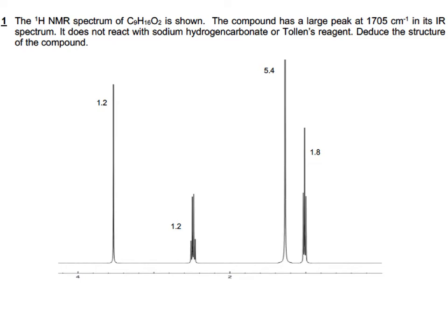We have these peaks, and they are called signals. In this particular spectra, highlighted with green, are 4 signals. I'm going to refer to them as hydrogen environments. They are unique hydrogen environments, which I'll explain a little bit more in a short while.